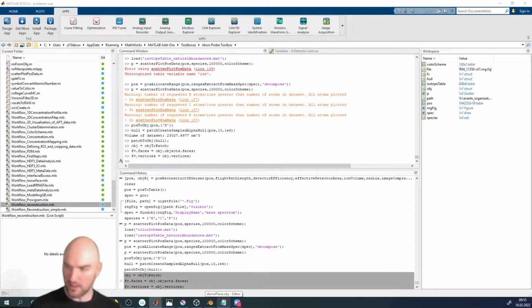The question was, how do we do the grabbing again? G for grab. Yeah. So sorry, in the break I'm going to install the screencast keys successfully so that you can always see what buttons I'm pressing and what mouse actions I'm doing and so on and so forth. I should have done that beforehand. Sorry about that.